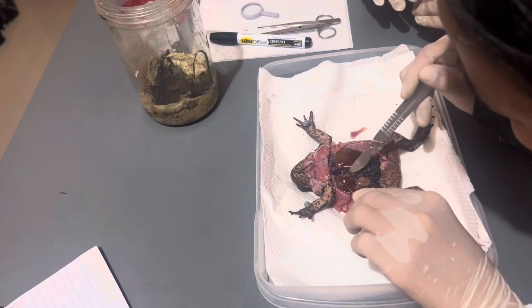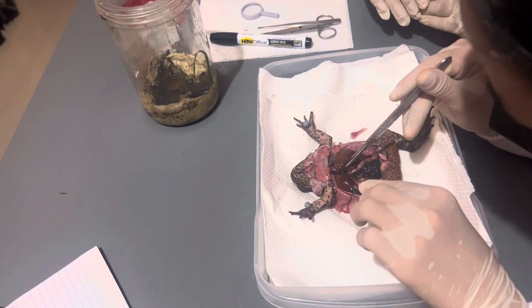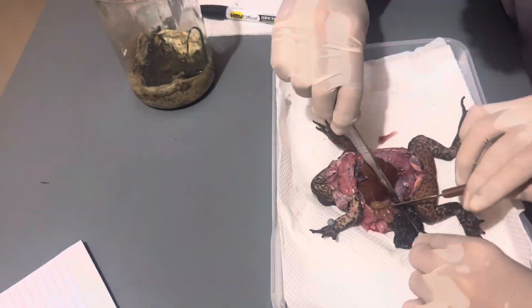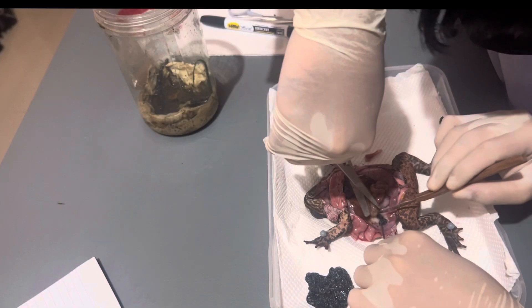So for now, we will be exploring and trying to identify the organs. Here we can see the ovaries. Ovaries in amphibians produce a huge number of ova, while those in mammals release only a single ovum or egg. This is the female reproductive system of frogs — it's where eggs are produced.